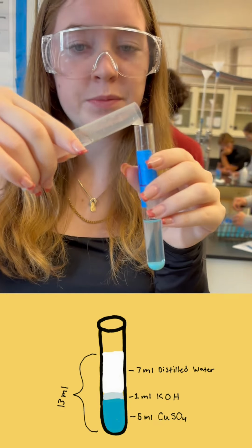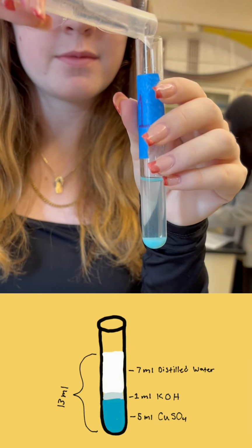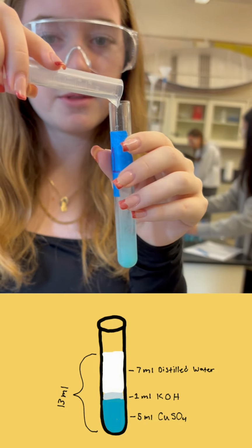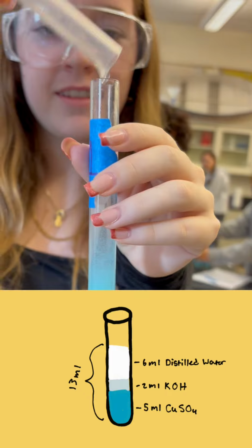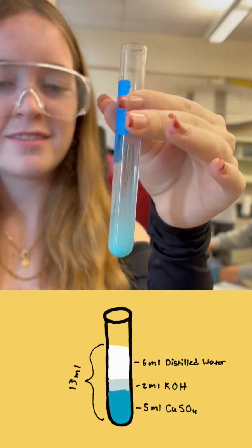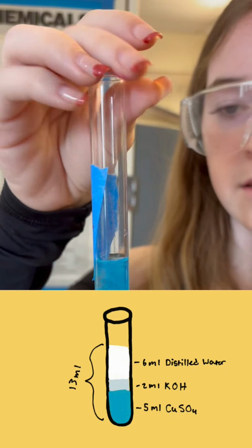Test tube 1 had 5 milliliters of CuSO4, 1 milliliter of KOH, and 7 milliliters of distilled water, all adding up to 13. Test tube 2 also had 5 milliliters of CuSO4, 2 milliliters of KOH, and 6 milliliters of distilled water. This pattern repeated until all test tubes had 13 milliliters of liquid.